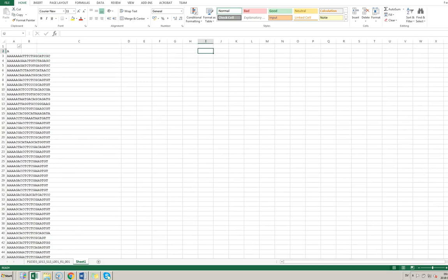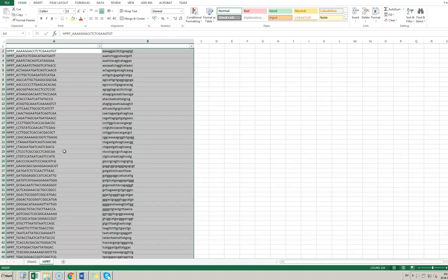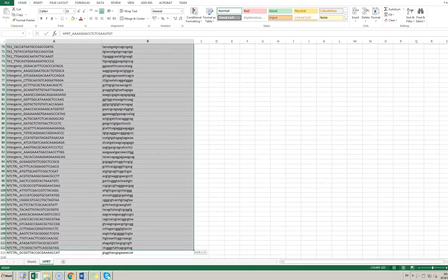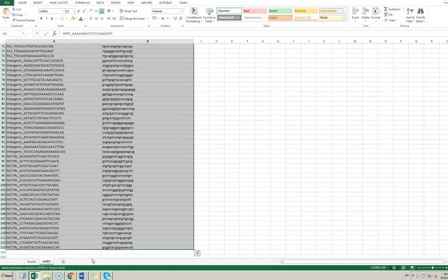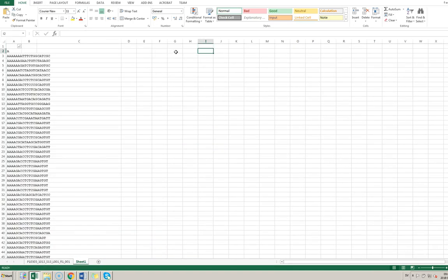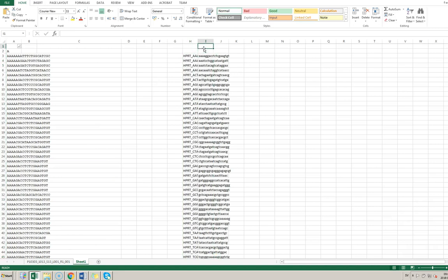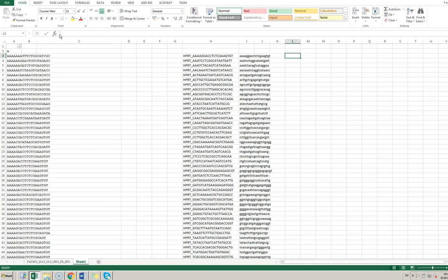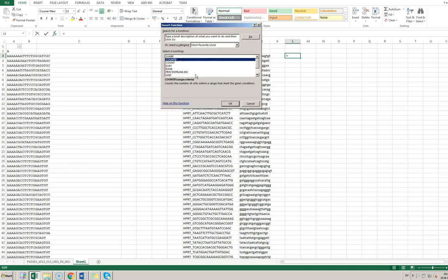Now I'm going to copy our list of guide RNA sequences from the reference library and paste it in here. Then to get a brief overview, I'm going to use the COUNTIF command — counting how many times each reference guide RNA sequence appears in our extracted sequence data.